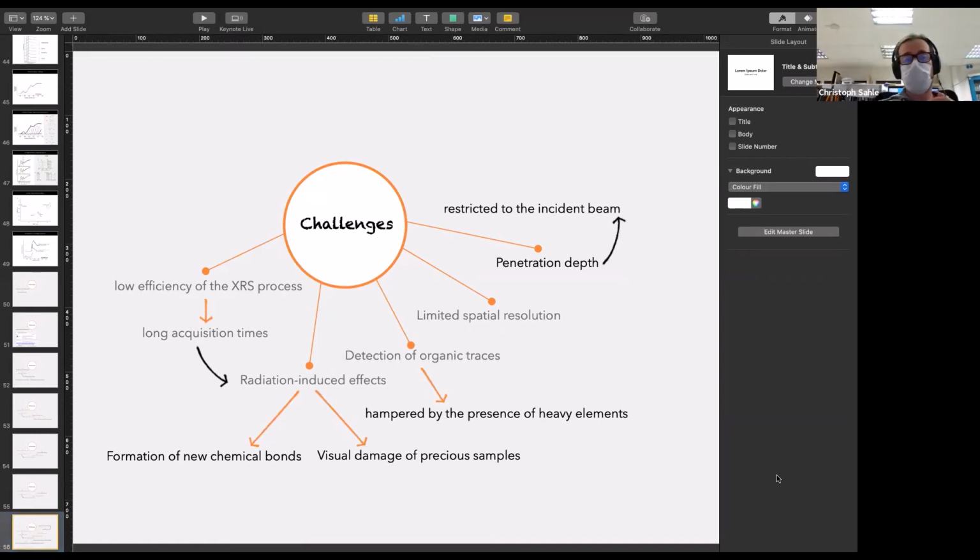How we improved? Yes, the beam. How to say that? I think overall, at ID20, we don't have more photons, but we have better photons. So they're nicely concentrated in a small spot. So it's less than 10 by 10 microns right now. And I think this will partially translate into the spatial resolution, via the processes that Rafaella described.